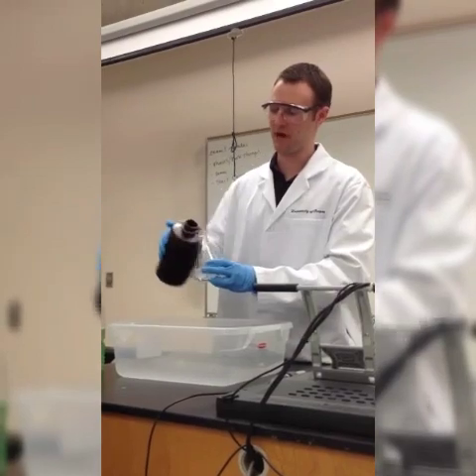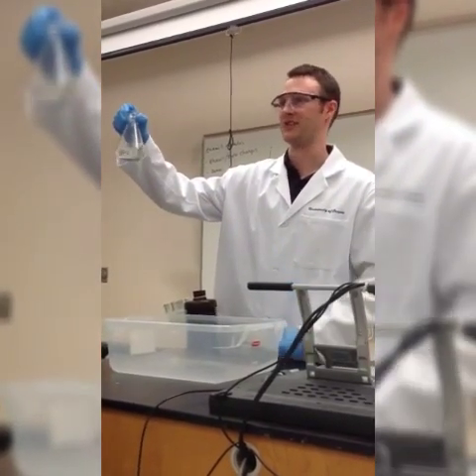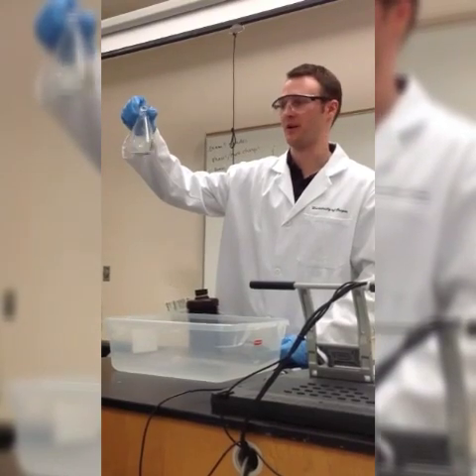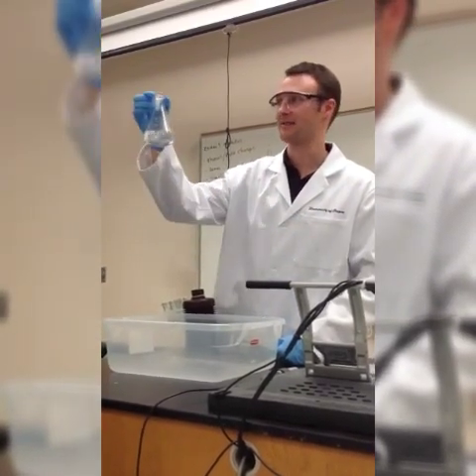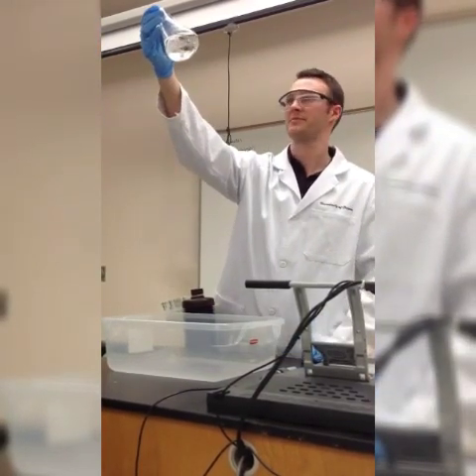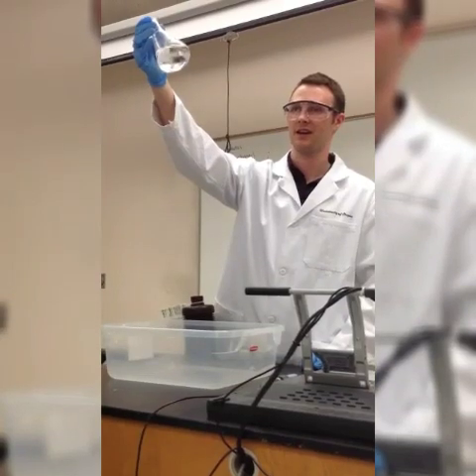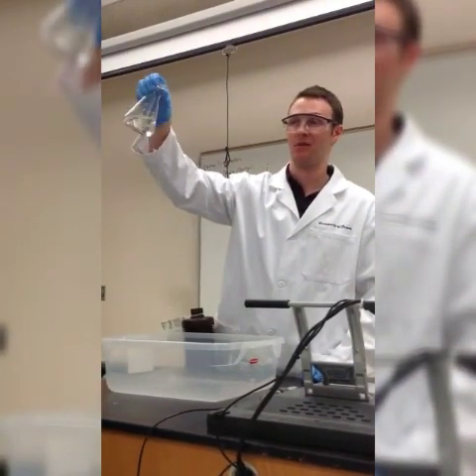And you notice, perhaps not surprisingly based on its formula, it looks a lot like water. H2O2 is not that much different than water, it has a slightly different formula. But like I was saying, it's not very stable. But do you see anything happening right now? Does it look like I'm forming a bunch of oxygen or anything like that? It's just kind of water, right?